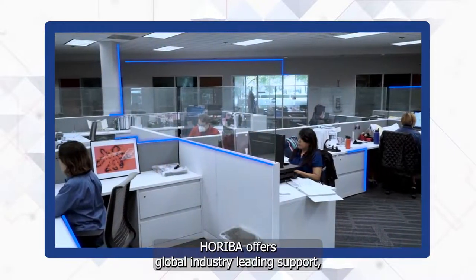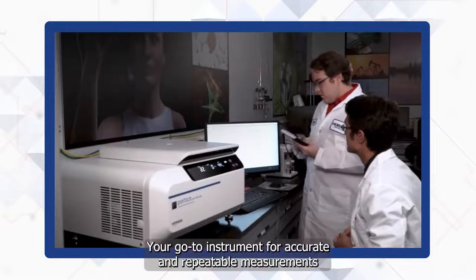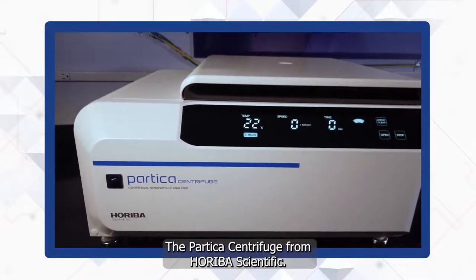Horiba offers global, industry-leading support, keeping customers' instruments running in peak condition. Your go-to instrument for accurate and repeatable measurements with superior reliability. The Partica Centrifuge, from Horiba Scientific.